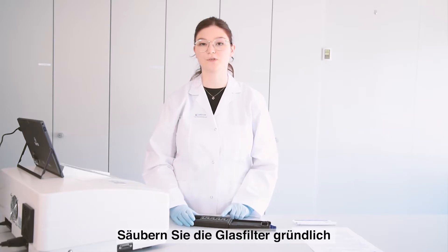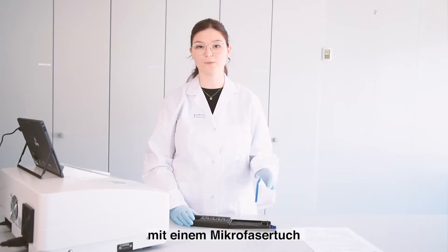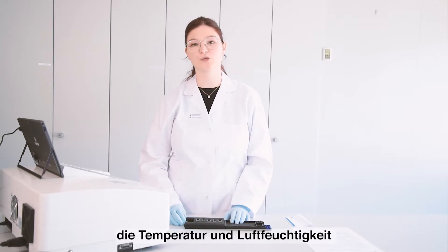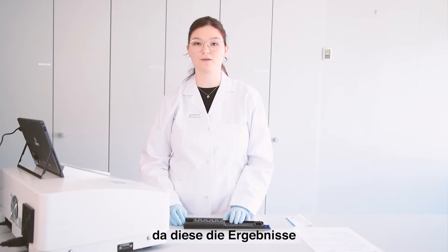Be sure to clean the filters with a lint-free cloth before inserting them into the instrument. During measurement you should always keep an eye on the temperature and the humidity because they can impact the results.